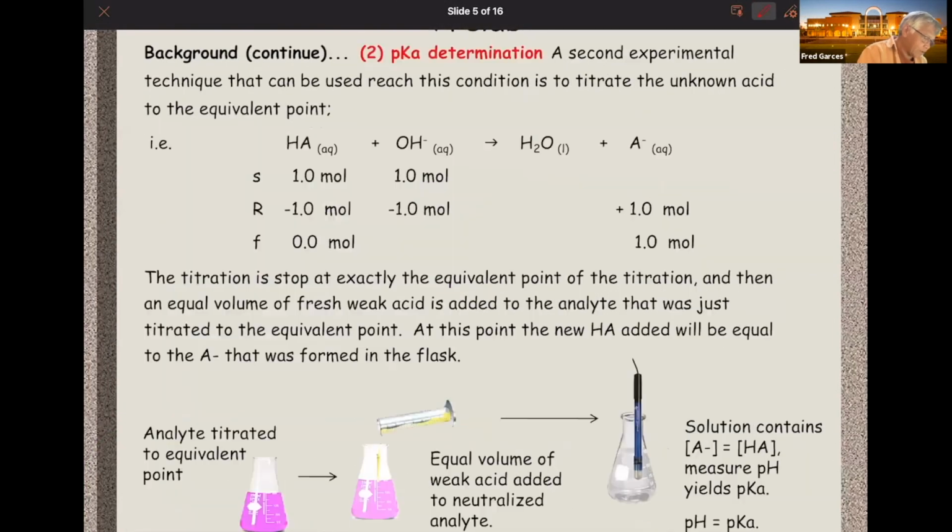Okay, so the first technique is you guys are going to do a titration, and the titration will require you to prepare. Well, prior to the video, you would actually prepare a standard solution called KHP.